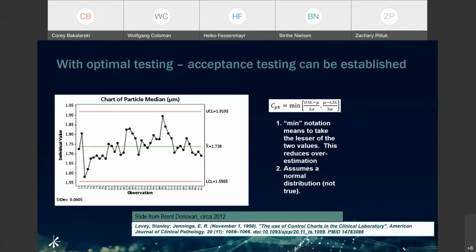and Pistoia and vendors like Agilent, Zontal are doing in order to make it possible to interchange data and to store data usefully for analysis, it all boils up to this, which is at some point you're going to want to be doing historical analyses and improving your methods, or at least defending them to the regulators. And these types of charts, where you're looking at the CPK in this case, are really, really important.